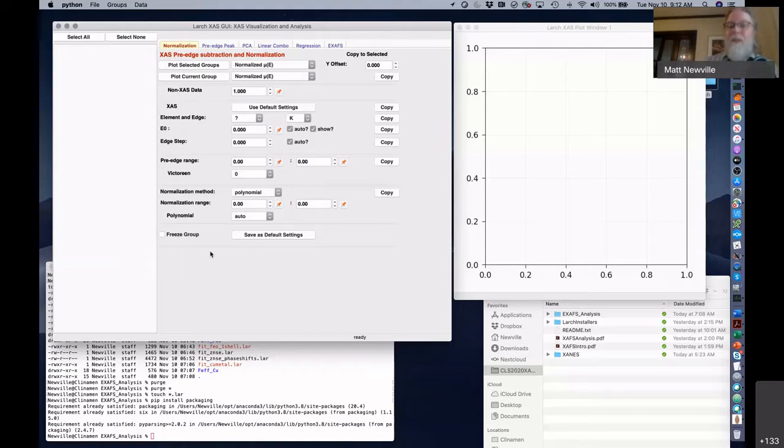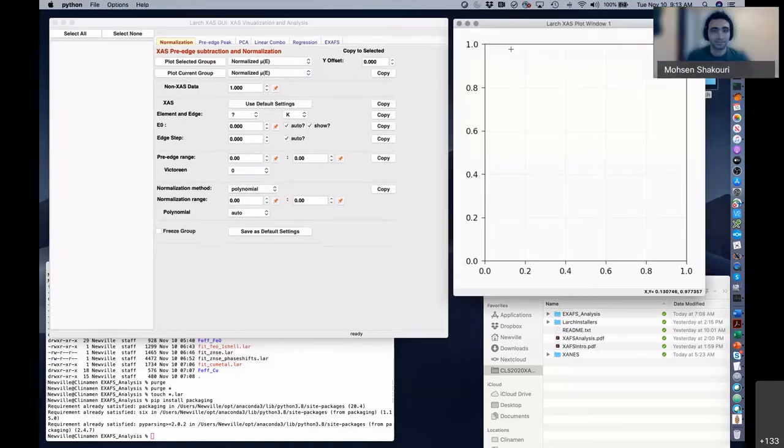So it appears to be one shell, but they're far enough apart that it severely attenuates that peak. So it's difficult to use the intensity of that peak as coordination number because it involves all these other factors. I hope that answers that question.